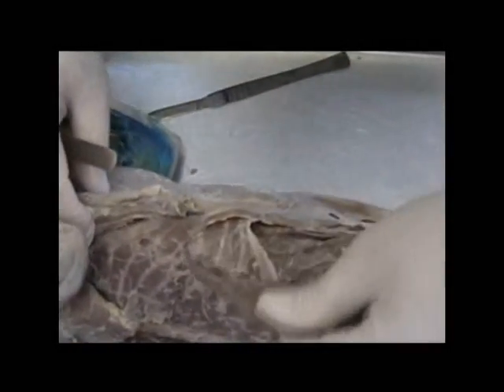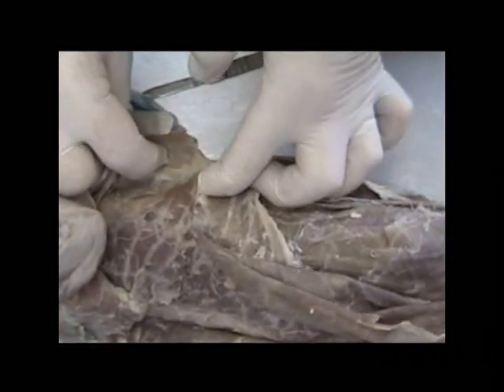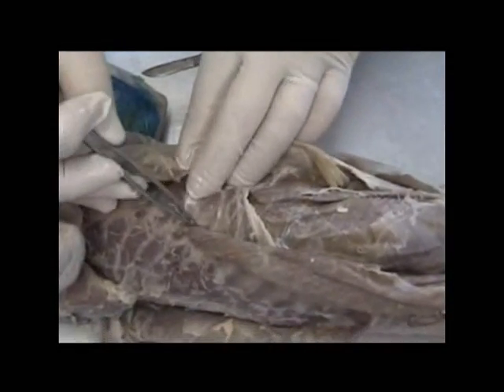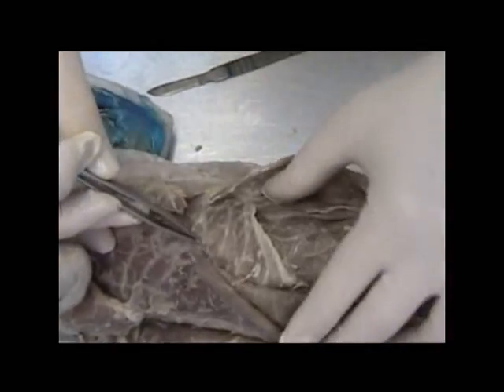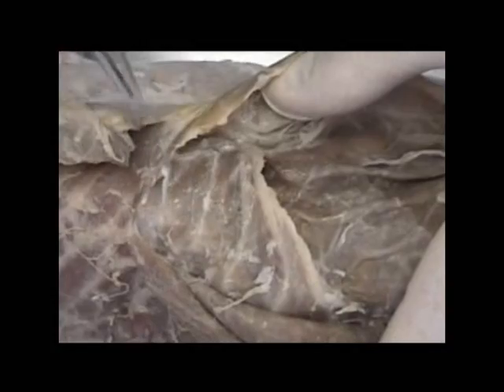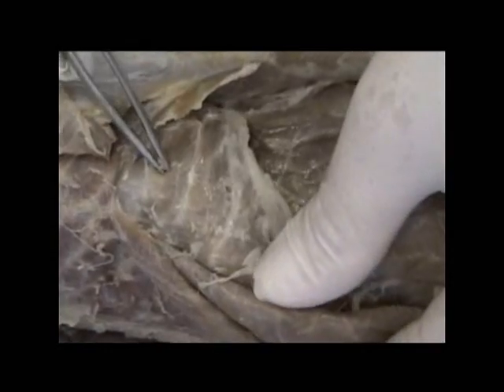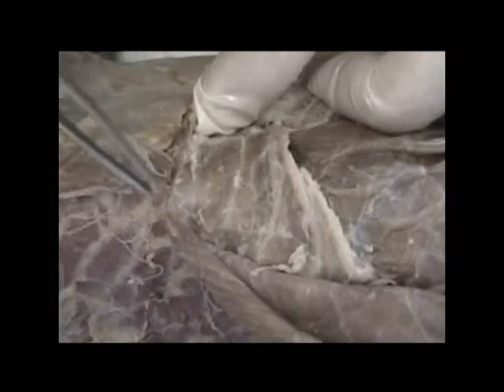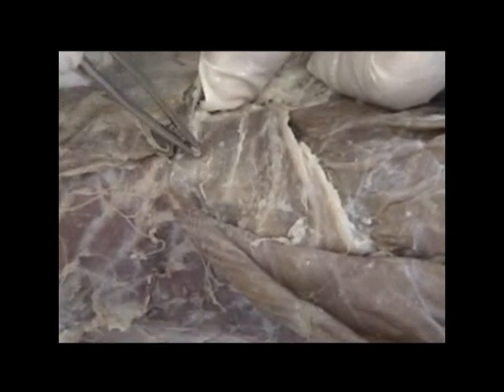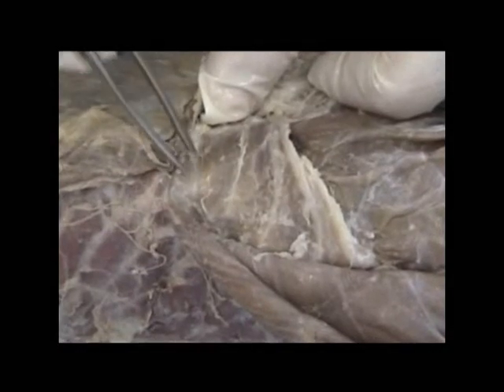If in turn we lay back those muscles again and come down to where the rib cage is, and you can feel the rib with your blunt forceps running across here, we see these very distinctive muscles running over the surface of those ribs from the outside, and these are the intercostals, the exterior intercostals. And what doesn't show up here as well, though, are deep to these exterior intercostals would be interior intercostals, again involved in the respiratory process.